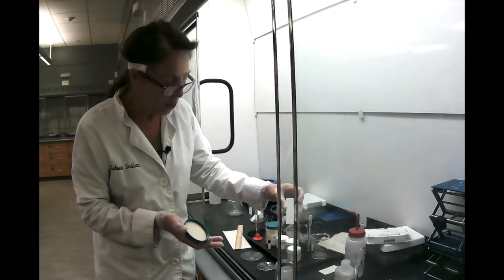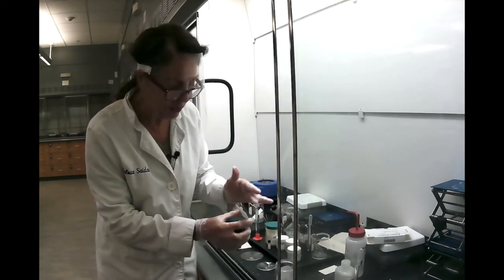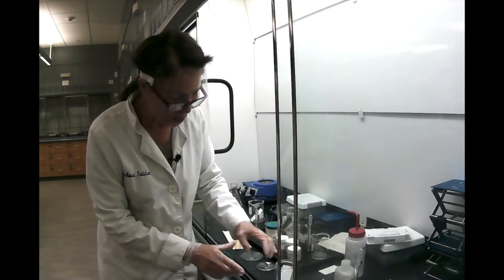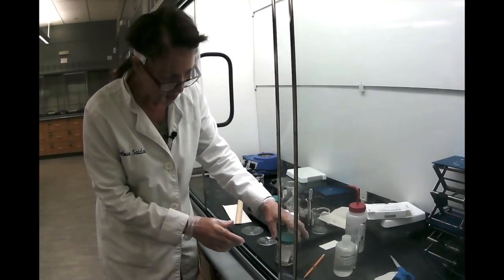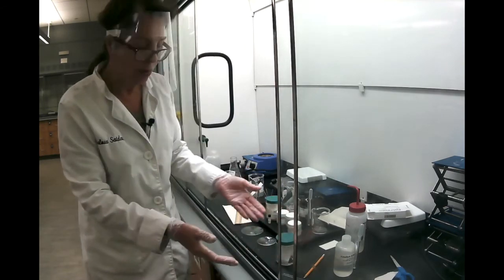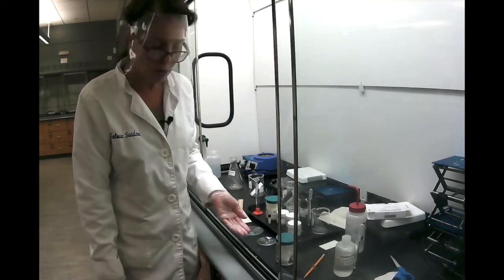So you have to slowly put your TLC plate in the jar and make sure that the back of it touches the filter paper. So this is how you should put it, slowly, and let it sit against the jar walls. And then you close it. That's the reason we use these jars, because if you let it open, your mobile phase will evaporate outside and it won't do the work it's supposed to do.